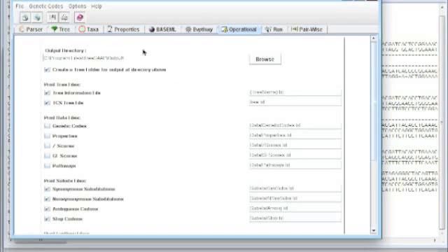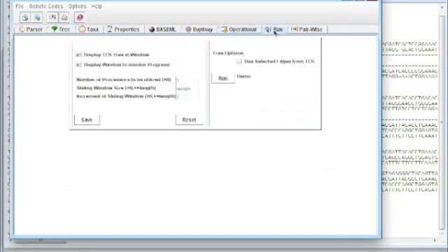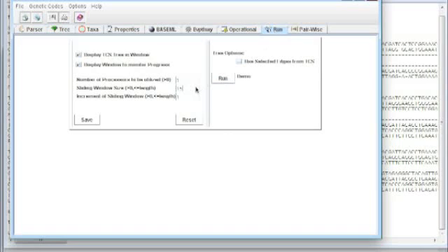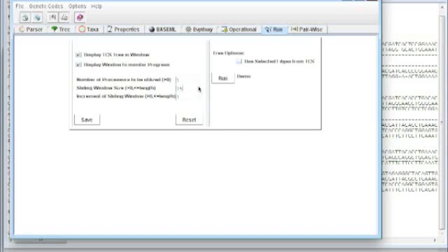When you go, you can choose an output directory. It's basically going to create a lot of output. And then when you're ready to run, you can just come to the run tab. Give it a sliding window length. You don't have to set one of these, but you can give it a 15. One other thing on this is we could have used, if we would have had more processors, we could have changed this number on our calculations. Also, the sliding window size, if you don't set it, it defaults to the length of our sequences. And this just defaults to 20. And that's probably pretty good. And you can just run it.